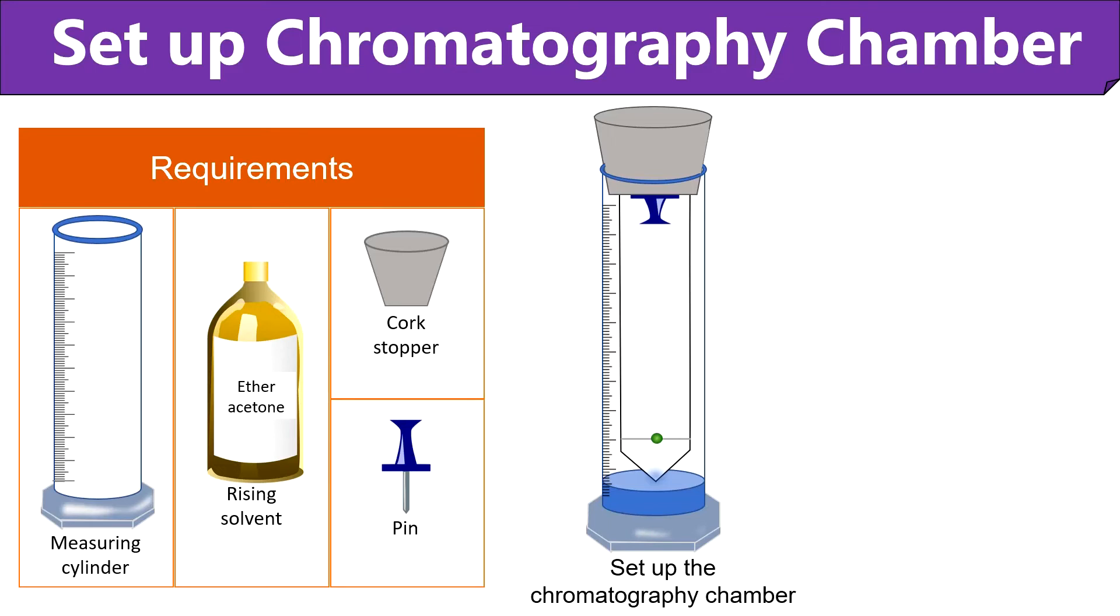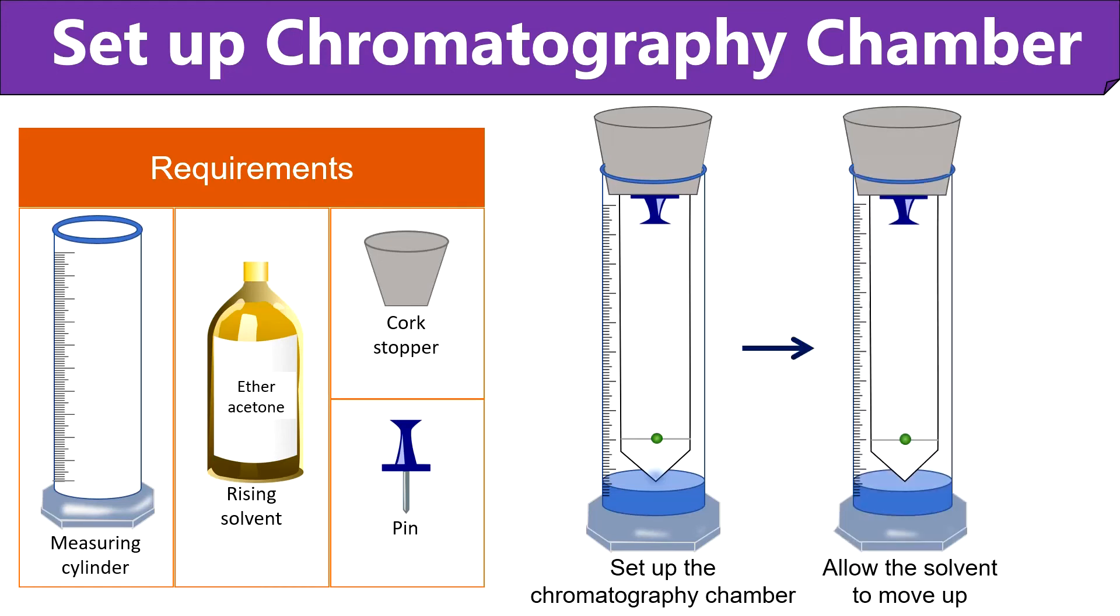Here you need to keep in mind that the filter paper should not touch the surface of the measuring cylinder. And the bottom edge of the filter must be only in touch with the rising solvent. After that, allow the solvent to run through the filter paper via capillary action.